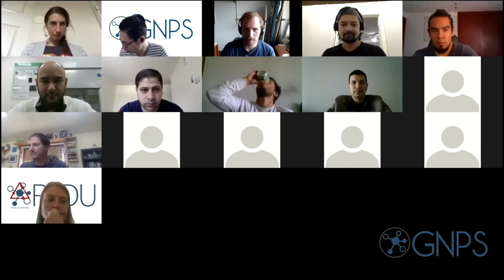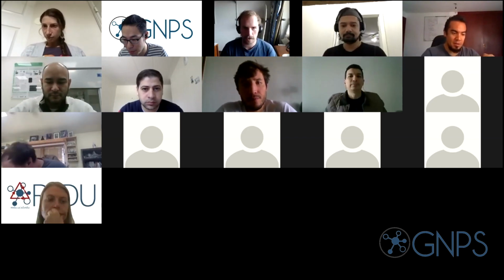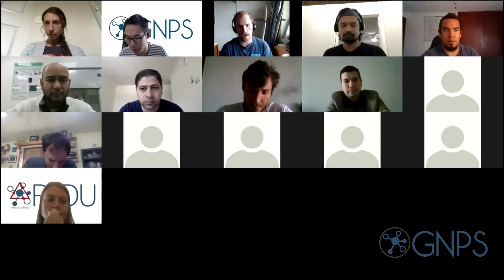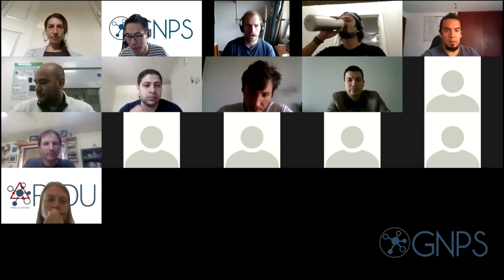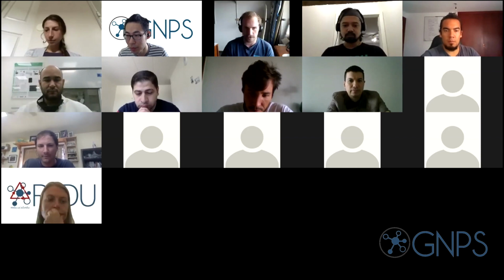All right, thanks Ming, and thanks Peter and Allegra for doing this together. It's really exciting. So my name is Daniel, and I just want to give you a very brief recap of molecular networking, and then talk a little bit about the principle of feature-based molecular networking. Then Allegra is going to show you the example data set we're going to deal with today in a hands-on tutorial, before we go through a step-by-step tutorial for the pre-processing with MZmine.